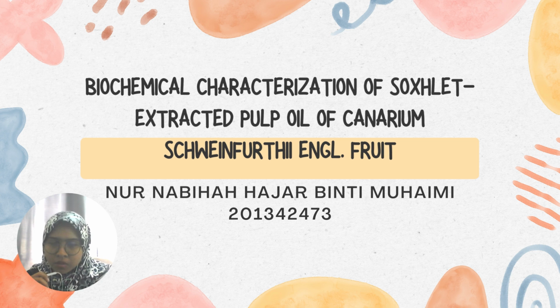I will present about the biochemical characterization of Soxhlet-extracted pulp oil of Canarium schweinfurthii fruit.